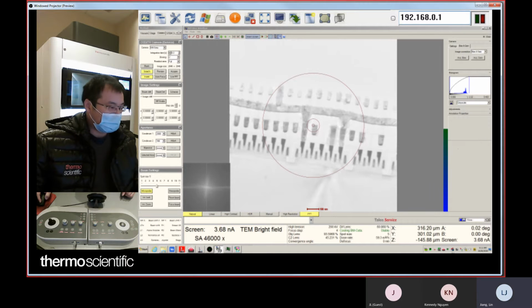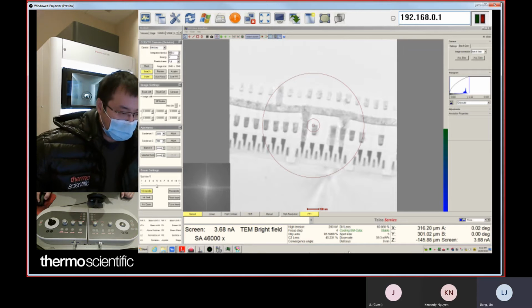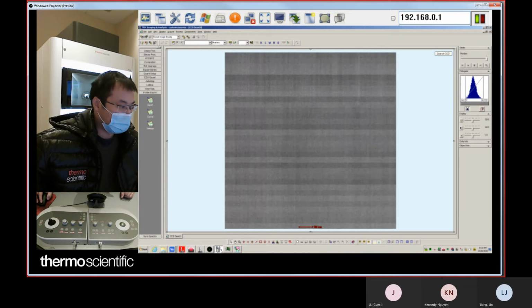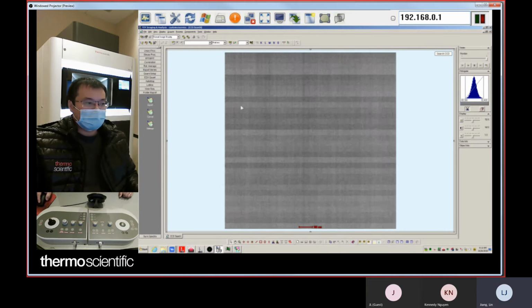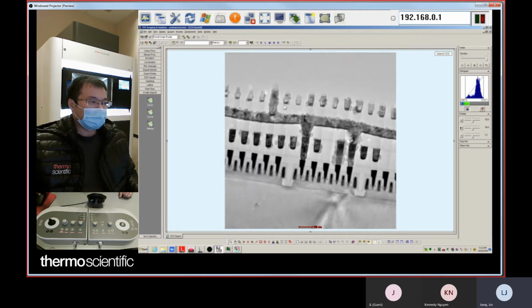Okay, it's in another window, so you will see it in a different window. I need to bring that up. Okay. Now you can see the window, right? This is your search, and then you can leave the screen, and then you get a search view.